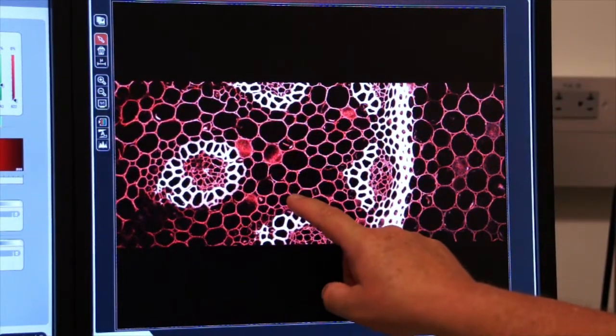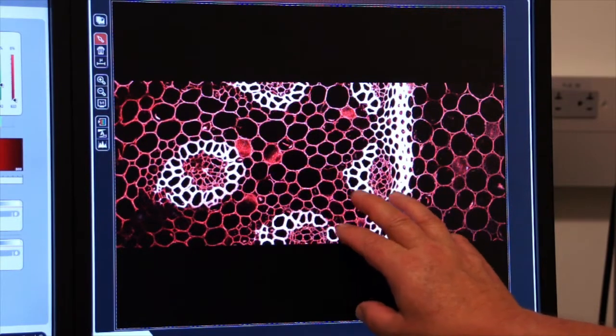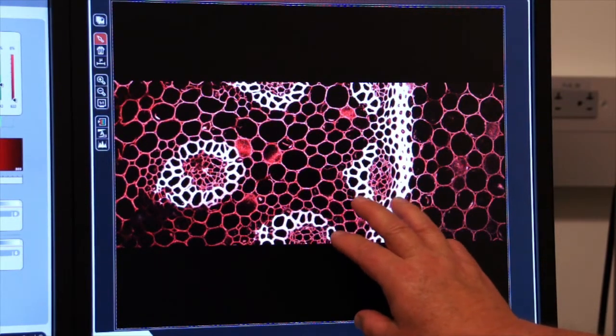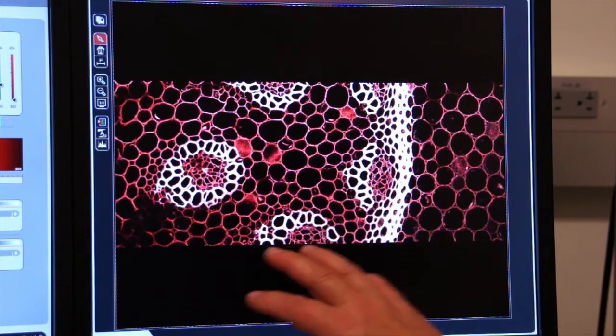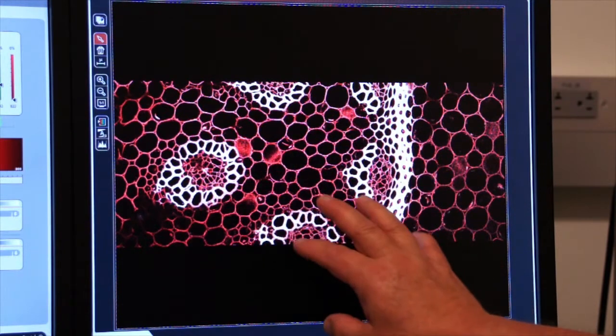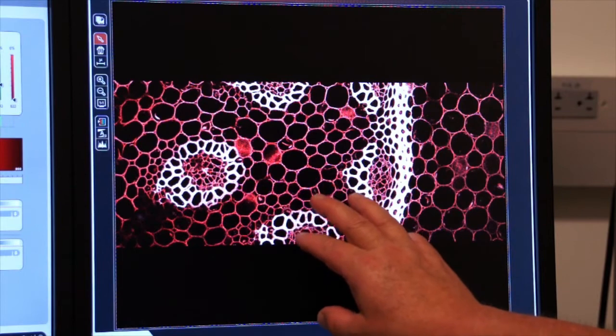So again, think outside the box. Use the tools that are available to you in this software so that you can stretch out into areas of the spectrum where you might not expect to see light, but it might actually be produced there.